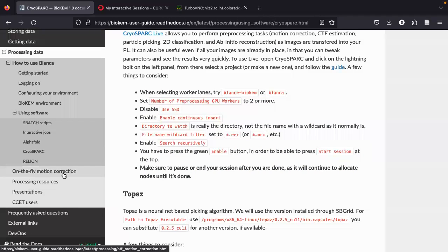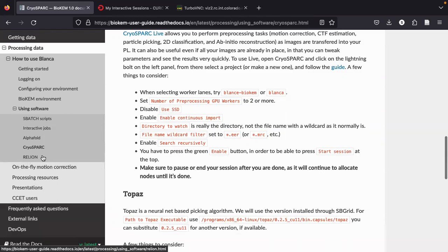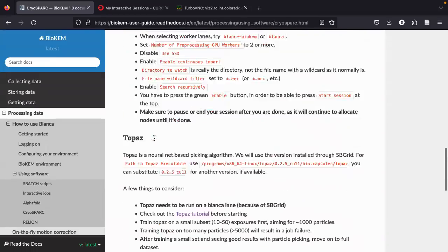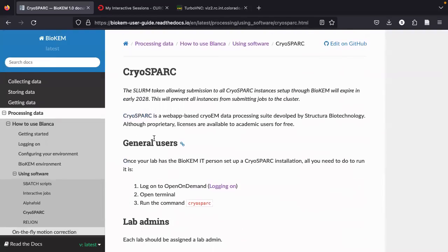If you want a newer version or to update it, I'll try to update them as new versions come out, but I have to do that. Users can't do that. And if you're used to running like the CryoSPARC M commands, you won't be able to do that either. I'm trying to get it where you can use the restart command and only the restart command, but I'm running into some problems with it, but you might be able to do that in the future. But, yeah. So other than that, I think that's all I have for this.